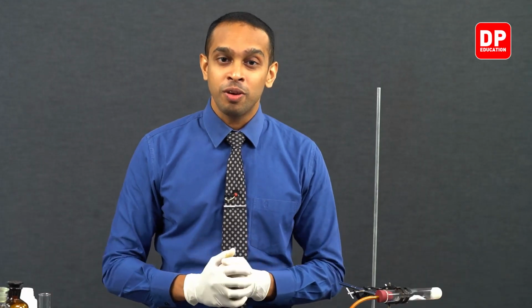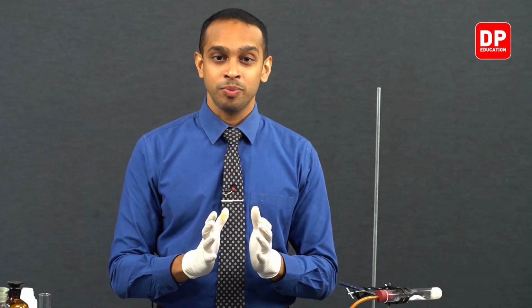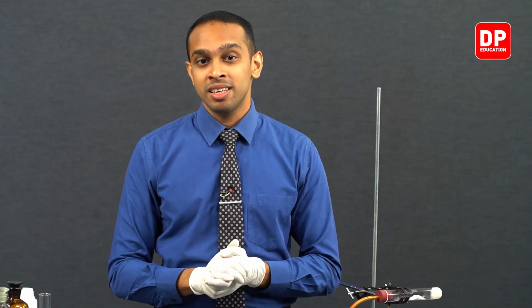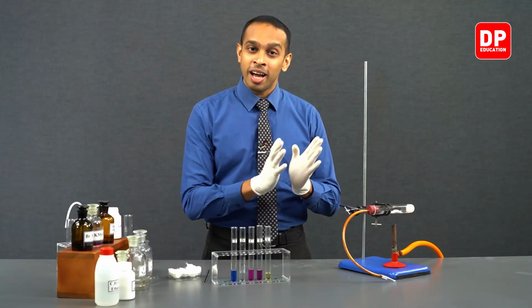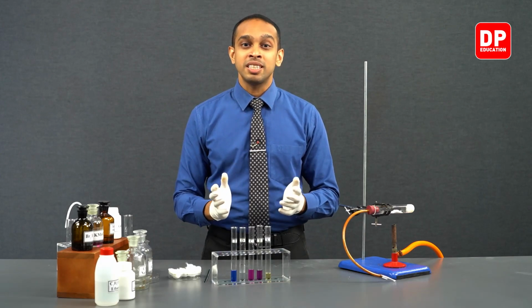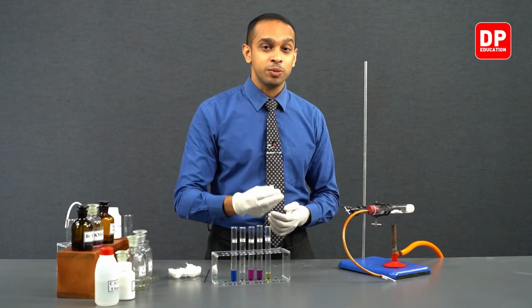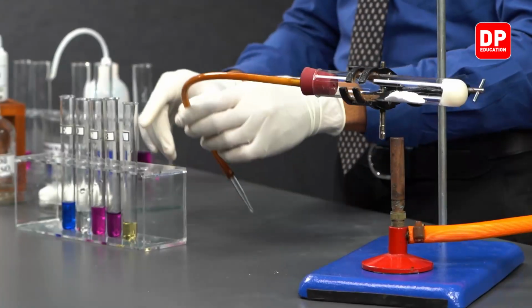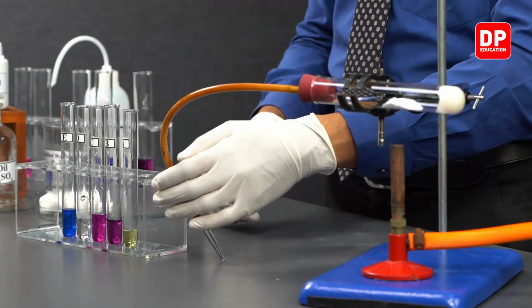As you know, when we have alumina or aluminium oxide as a catalyst, and when you send ethanol over heated alumina, an elimination reaction takes place where ethanol gets converted into ethene gas, releasing water. So the ethene gas that is produced is going to be introduced into each of these test tubes with the help of our delivery tube.